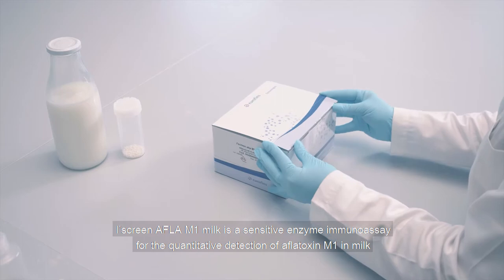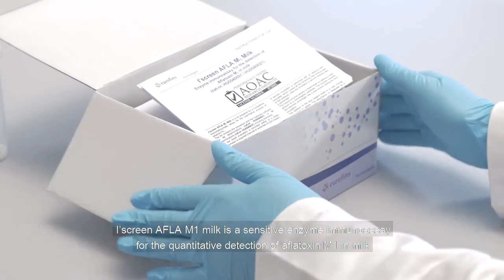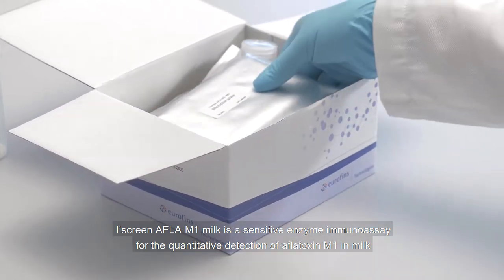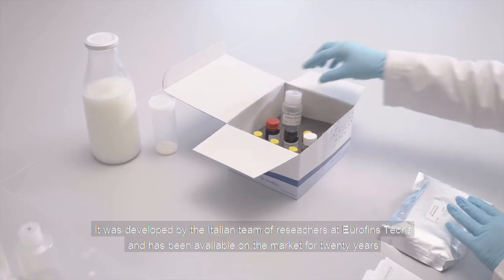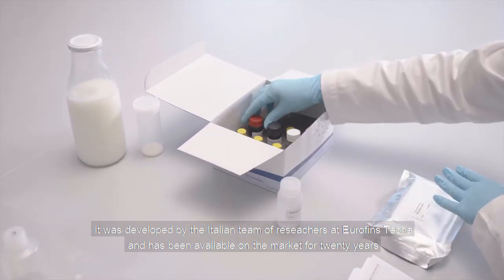Icegreen Afla M1 milk is a sensitive enzyme immunoassay for the quantitative detection of Aflatoxin M1 in milk. It was developed by the Italian team of researchers at Eurofins Tecna and has been available on the market for 20 years.